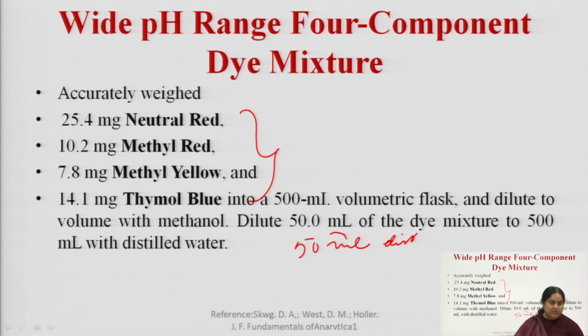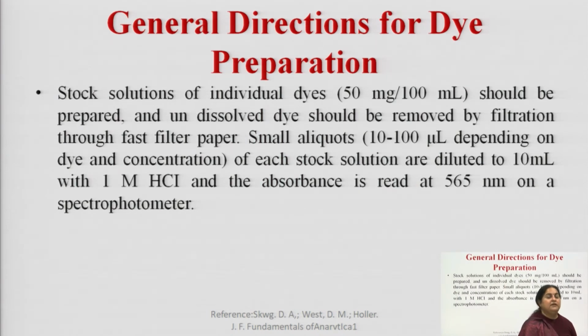It can be used for the determination of the pH of a wide range of test solutions.